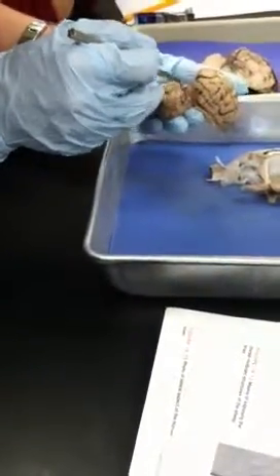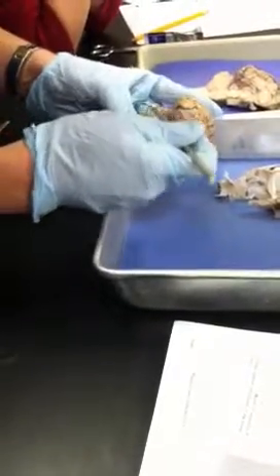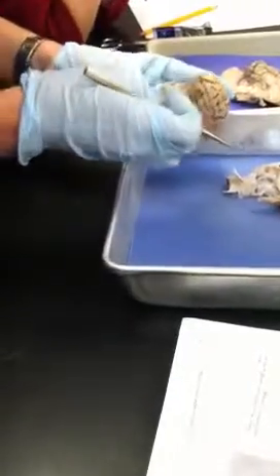I'm going to take off some of this arachnoid here. Is the arachnoid the dark stuff, or is that blood? It's got these blood vessels running through it. Oh, I see now. It's hard to see the arachnoid. So is this sort of spider webby kind of a thing? Sorry, I'm digging into the brain a little bit more than I wanted to. It's a lot of it on the frontal lobe of the other one, I think.